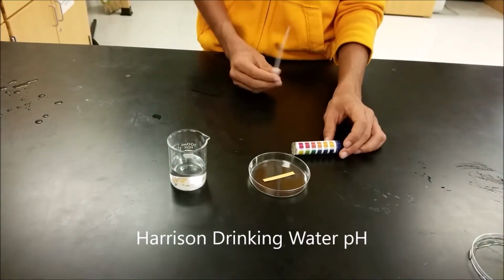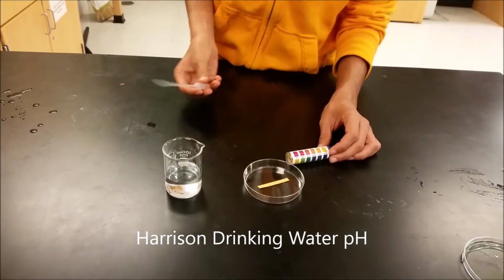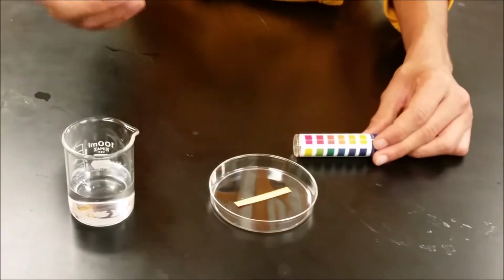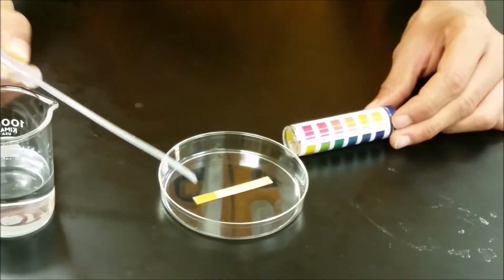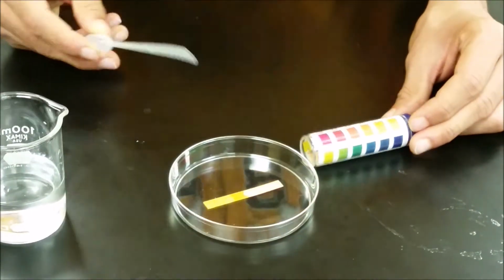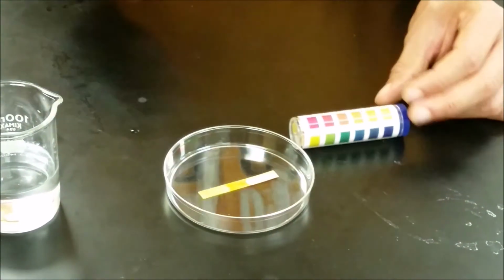40 milliliters of Harrison drinking water. It's from the fountain from the main office. Again, I have a pipette filled with a little bit of the water and a pH paper here to tell the pH. Okay, so the pH here is about a 7, which is good.